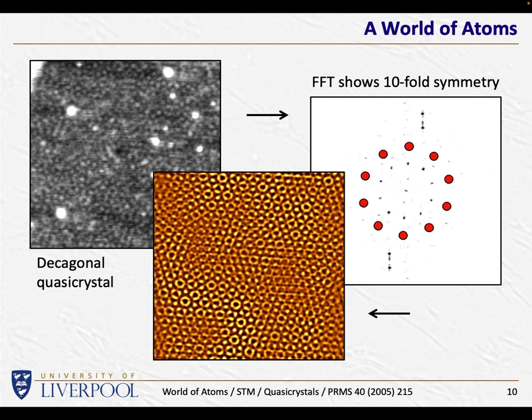But it is there. Yes, you have to be careful. If you're taking an image and trying to extract information from it by processing it in various ways, are you sure that you aren't overdoing it? Are you sure you aren't imposing structure that isn't actually there? One check you can do is to look at this image here and say, well, that looks pretty. According to this, there seems to be a little part of the surface which has got a donut, and if you count them, it seems to be a sort of daisy with 10 leaves around it. So, is that being imposed by the analysis, or are we bringing out structure that was there in the first place, but was rather difficult to see?